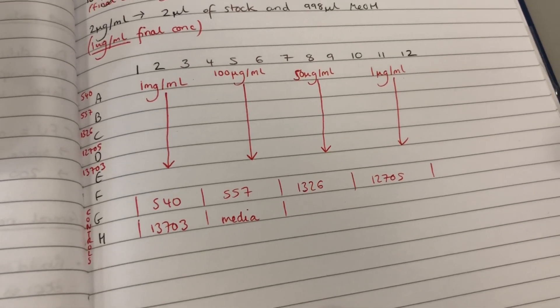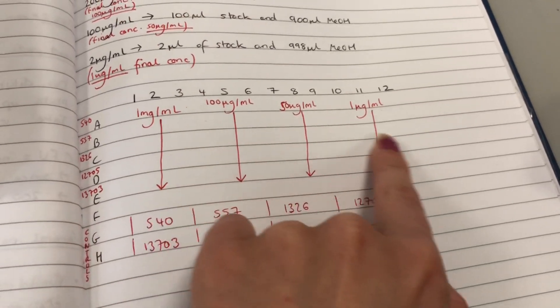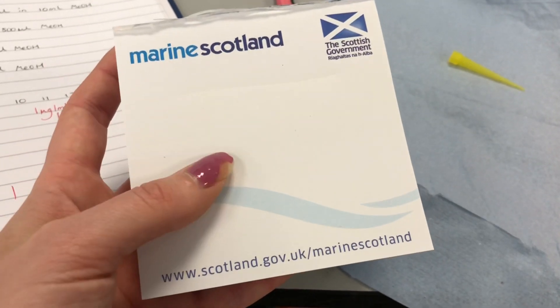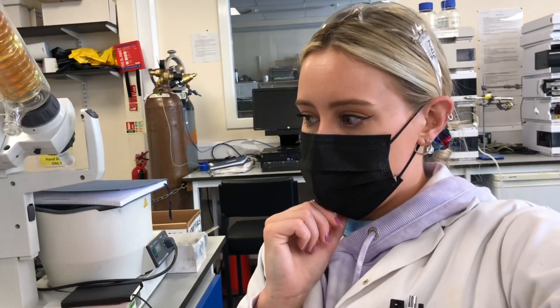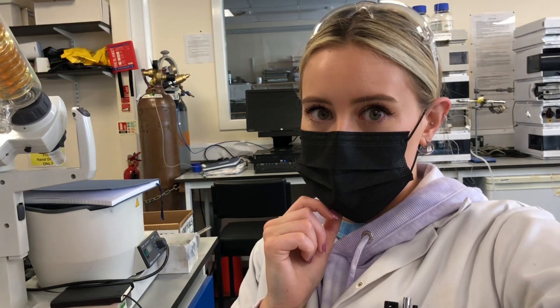This is my layout of the plate I want to set up this morning — these are my concentrations of the biocide I was speaking about earlier. I'm going to put this here as a visual prompt to look at while I prepare my plate in the hood. Very makeshift, but that's all I need. Now I'm going to make a little to-do list for the day and a list of things I need to bring on my mini field trip.